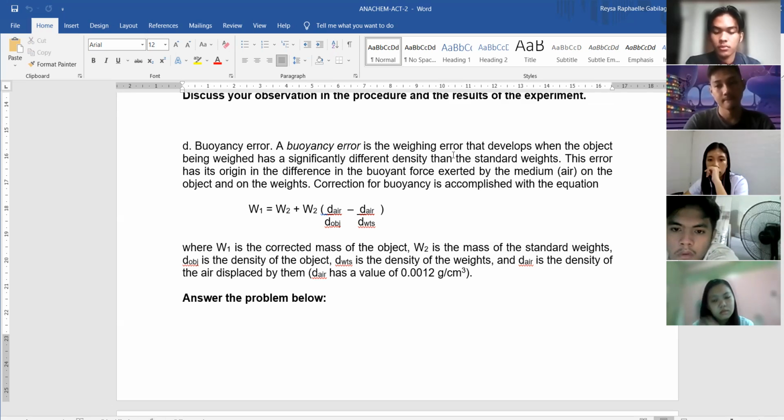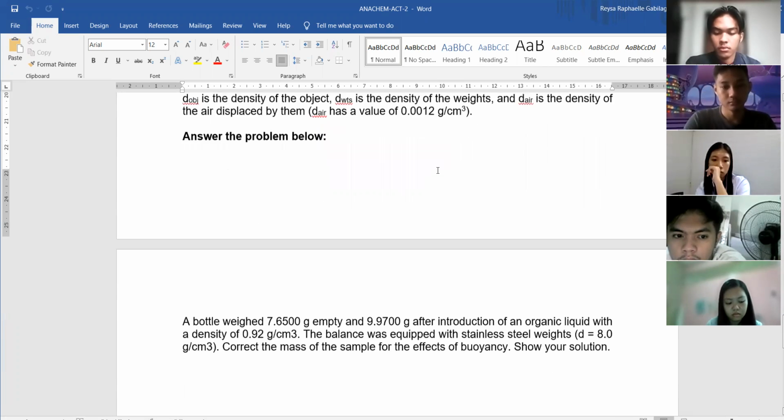Especially if na-open mo yung analytical balance, as you will draw the analytical balance, makikita nyo na may mga doors yan siya. And you have to close those doors before mo sulat yung measurement, yung final measurement ng mass. Na pag may nakapasok dyan na air, kasi hindi nga na totally na close, magbabago yung weight ng substance mo and magkakaroon ng error. So we really have to correct.